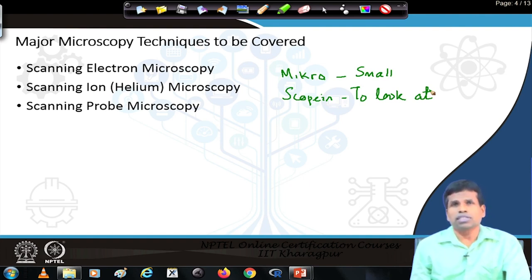We visualize all the objects through our eye. Just mere presence of eye may not be enough to see an object. For example, you are in a room painted with black color paint on the wall, and you switch off the light, window is closed, door is closed, so there is complete darkness, let us say in the middle of the night. Can you see an object even though your eyes are present? You cannot see any object present in the room because of the darkness.